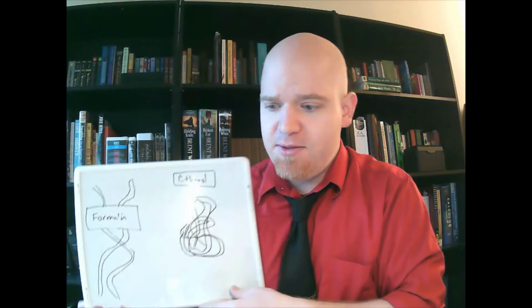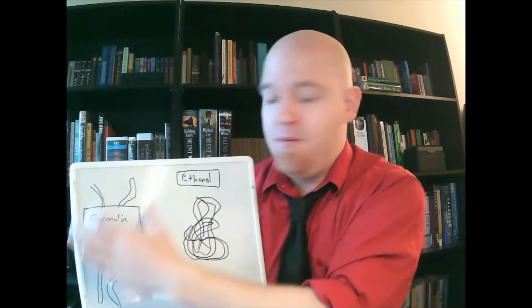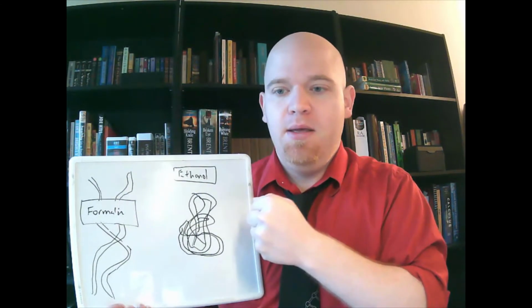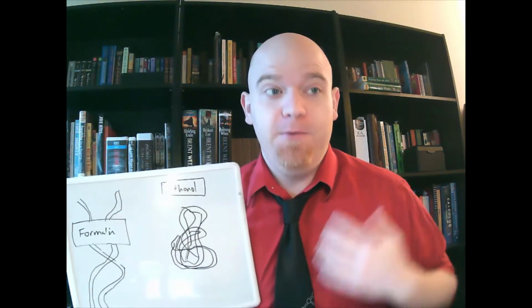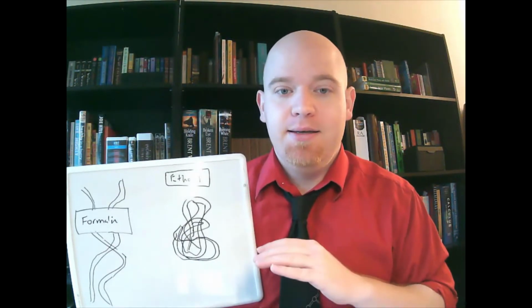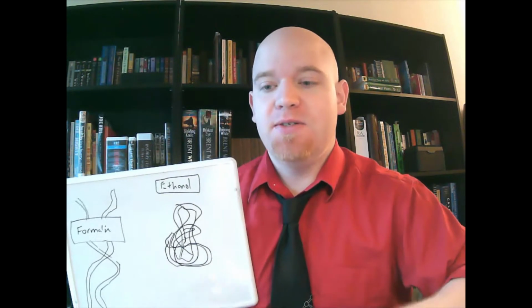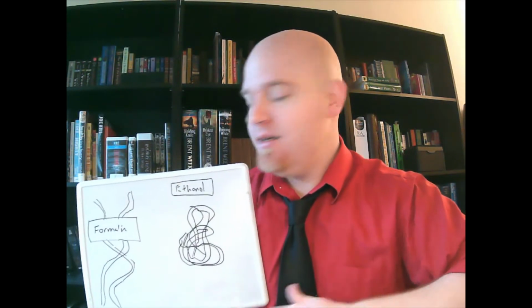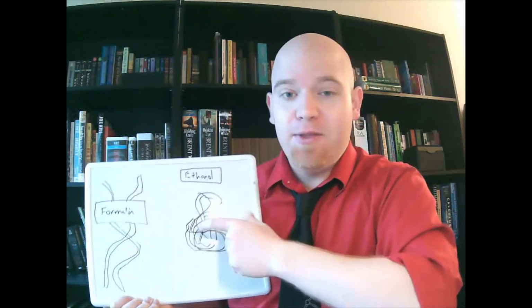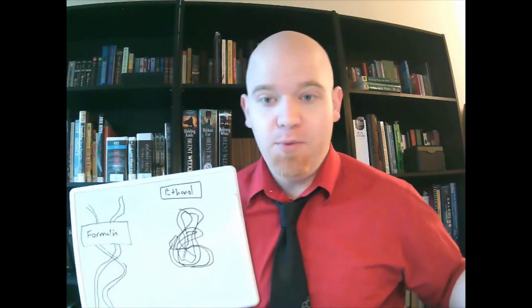And what ethanol does is instead of being a band-aid, it takes that active site, that pair of pliers, and just crumbles them. And by doing that, it stops the protein from changing its conformation and from acting. And that's what you want to do. You want to freeze these things in time. You want to stop them from acting. So between the two, formalin gets a lot of the things, ethanol finishes the job, and then we go on with the rest of the processing.